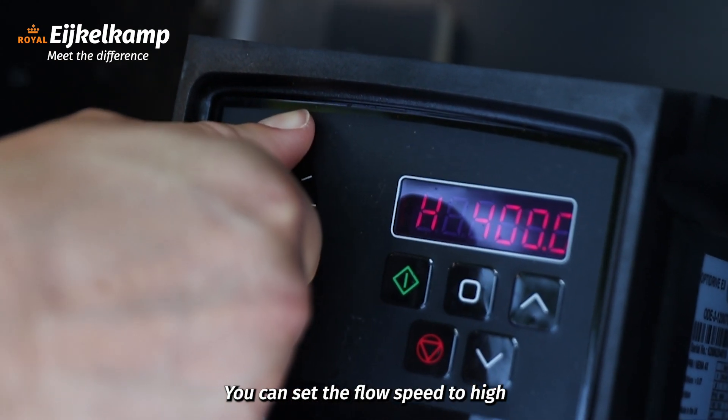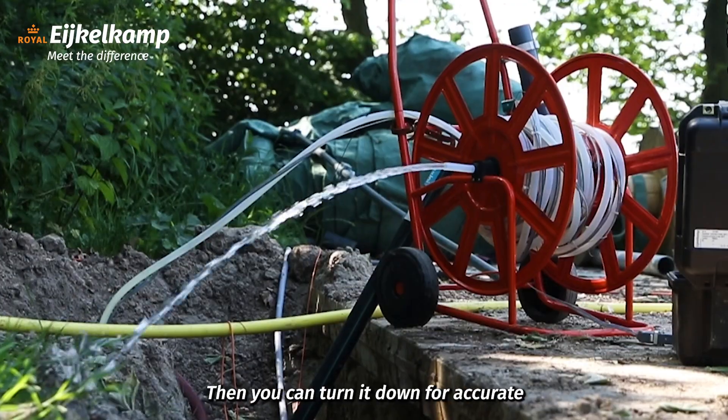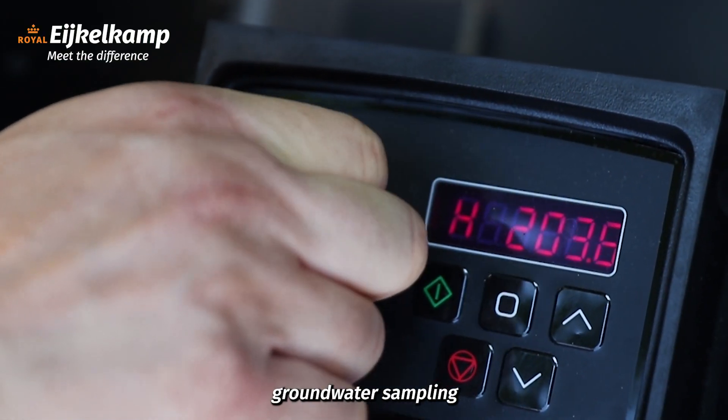You can set the flow speed to high to quickly purge the well. Then, you can turn it down for accurate groundwater sampling.